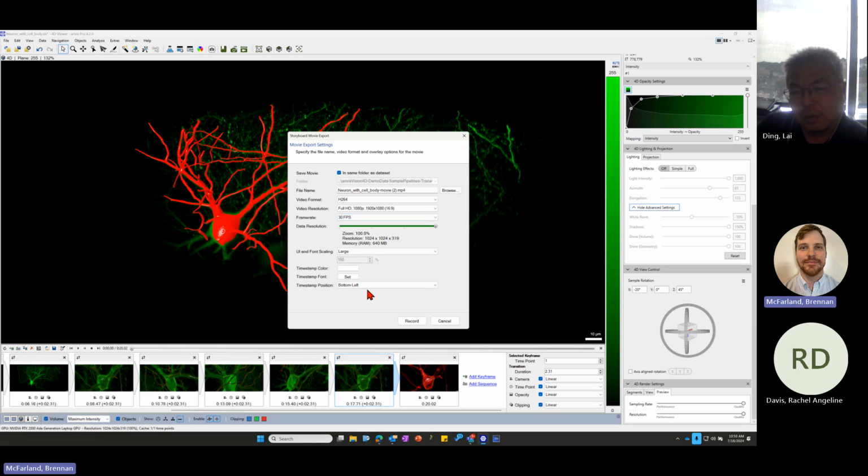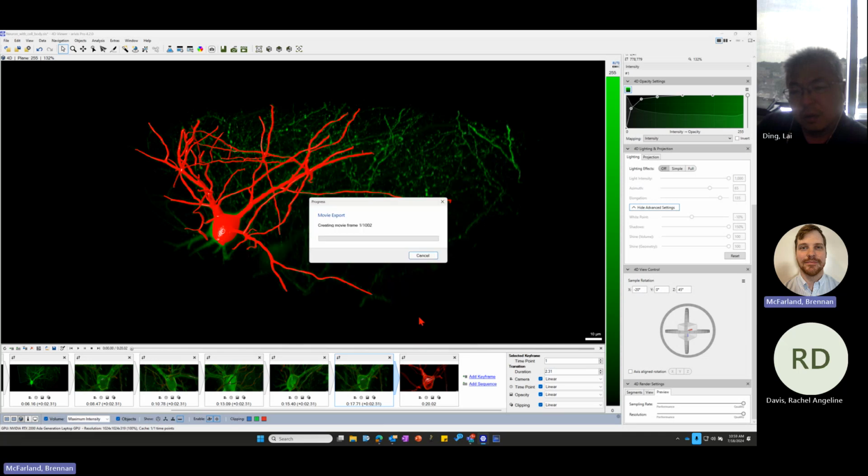I'll go ahead and do it to 60. I'll let this go and record, and then I can send this to you with the screen recordings whenever it's done. This way you can have an idea of what it looks like. Trying to think if there is anything else that I'm missing with this.